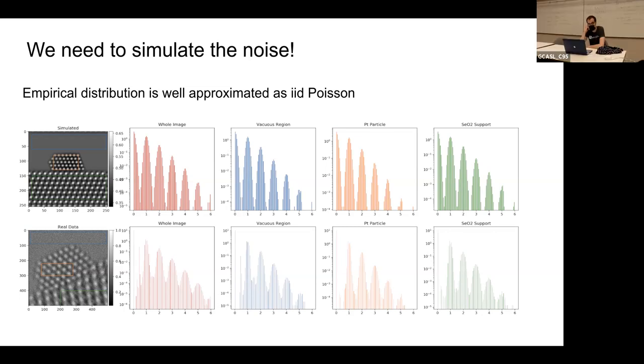Something that is very important for denoising is the fact that it seems that the noise is IID, meaning that the noise between two pixels is uncorrelated, it's independent. Of course, the two pixels are not independent because of their underlying structure. If they both belong to the same atom, then their values are going to be very much dependent. But the actual noise that corrupts them is independent, which is really helpful. Just to add to that, that assumption is more required for the unsupervised methods. That's correct. That's crucial for the technique that I explained before, where we use just noisy images to denoise.